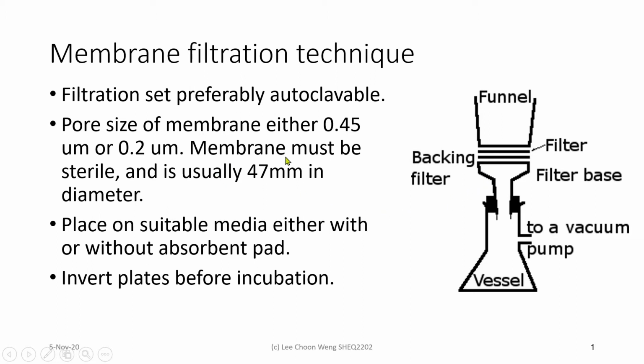Okay, the pore size used is either 0.45 micrometer or 0.2 micron. Okay, the membrane should be sterile. If you can purchase it pre-sterile, then it is good. If you cannot, then you have to autoclave it and then dry it before use.